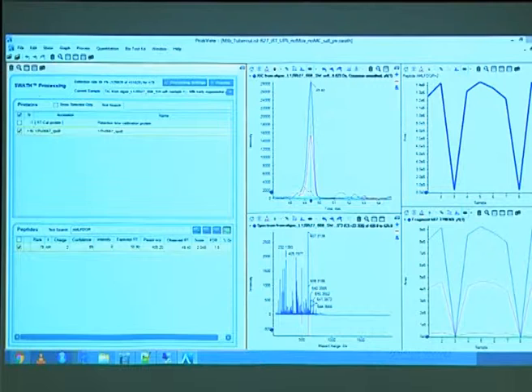One example that I like to show you is this one here. That's a bit of a problematic one. As you can see, it's from the same protein. We know the protein is in there. It's still from RPOB. It has a nice peak, or you see nice intensities, for two of the transitions, but the other three are very low. When you see in number 3 and 8, it's actually not identified, or it got the wrong peak.